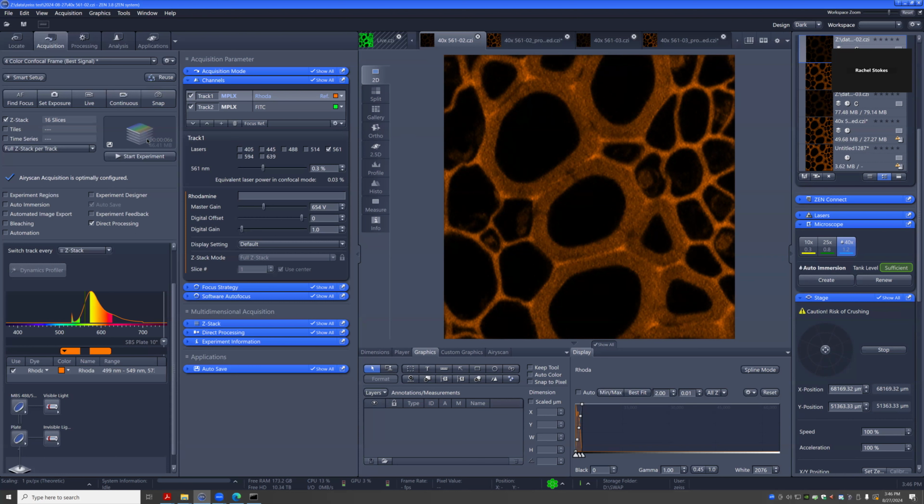Once you hit start experiment, it'll make a new tab, and it'll also be generated in a temp folder. So you can actually see in there everything that's loaded here, even if I haven't saved it yet. But I do recommend autosave, it's the easiest. You just give it a name once and then it'll put all of those into the same folder. So that's really nice.